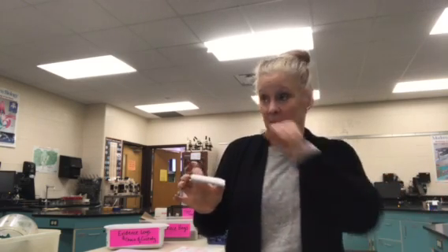Now, normally, they would take tweezers and probably just get down and pick fibers off of the carpet to take a sample. In some cases, they're lifting off of clothing and they're looking for hair, so they're just using tweezers. But they take that hair and put it inside that bindle. We're kind of doing an extra step by doing a lift, but that's so that we can practice using that kind of electrostatic lifting process.